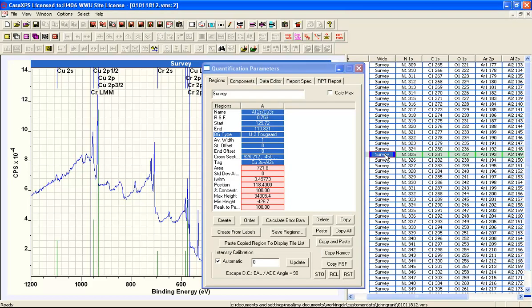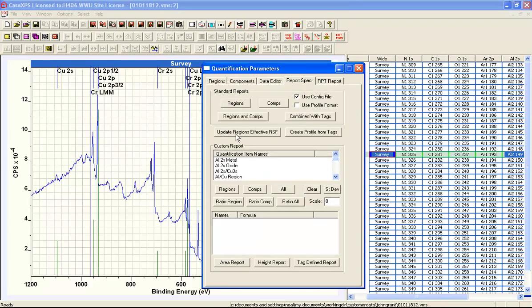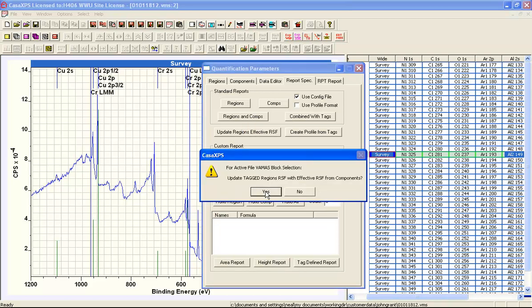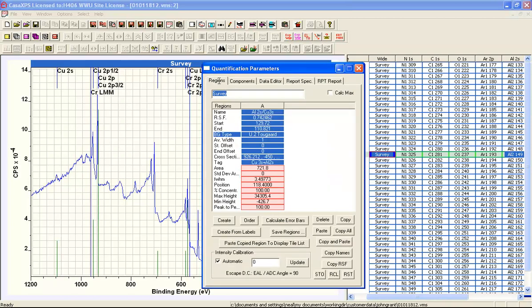Now that the tag field for the region on the survey spectrum matches the tag fields of the components on the high-resolution spectrum, I select both and click 'Update Regions Effective RSF.' It asks for confirmation, and having performed the operation, the effective RSF has been transferred from the high-resolution data — based on the peak fit — into the region on the survey spectrum.